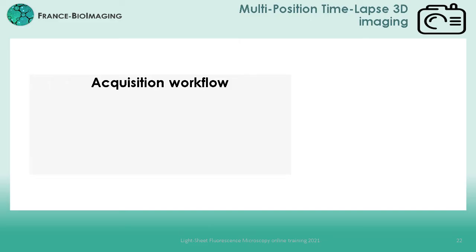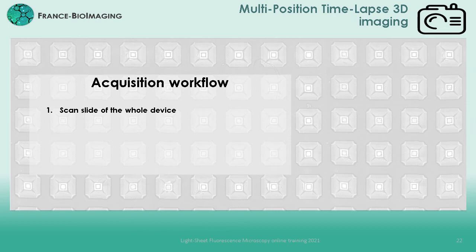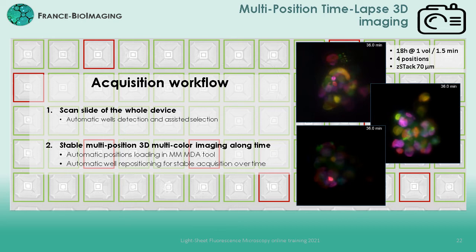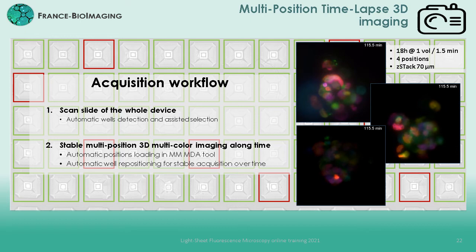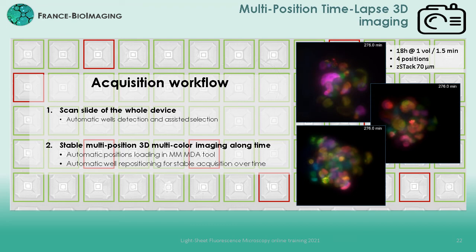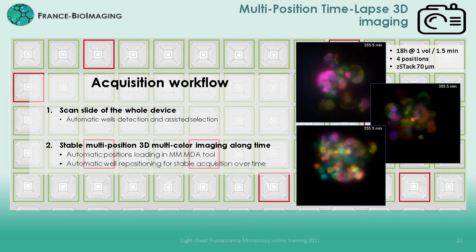We will now see how to parametrize multi-position timelapse 3D acquisitions to leverage the SOSPIN device architecture and monitor several samples in parallel, greatly increasing acquisition throughput. We developed several tools to assist in detecting the wells we want to image and stabilize the system for long-term acquisitions. The acquisition workflow is divided into two parts: first, a scan slide of the whole device surface to automatically detect all the wells and simplify their selection; then, using the MDA tool, parametrize and launch a timelapse multi-position acquisition with a drift correction tool allowing stable acquisitions over a long period — up to days. As an example, we acquired four positions for 18 hours every 90 seconds over a volume of 70 micrometers with no noticeable drift, image quality degradation, or phototoxic effects.